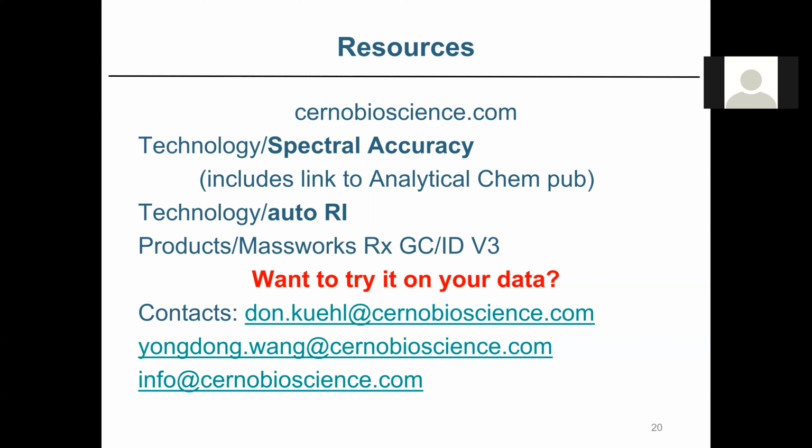Next question. Can this be used to identify novel unknown compounds that are not in the library? That's a bigger challenge.